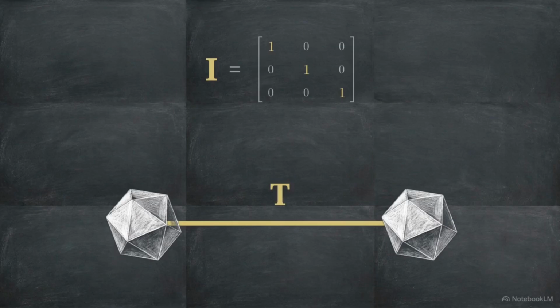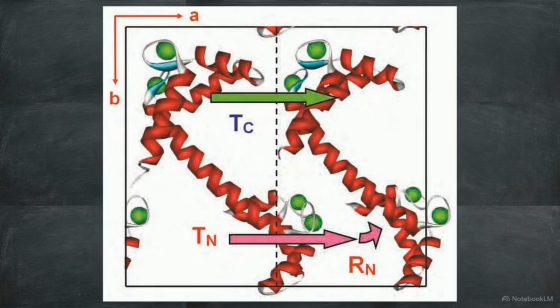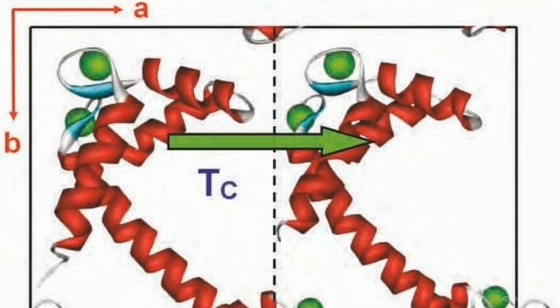translation vector, T. In this triclinic calmodulin structure, the asymmetric unit contains 2 molecules. Between the C-terminal lobes, rotation is functionally 0. Instead, the molecules are shifted along vector A over 2, sitting nearly perfectly parallel to the cell edge.